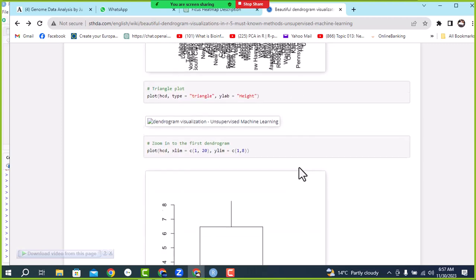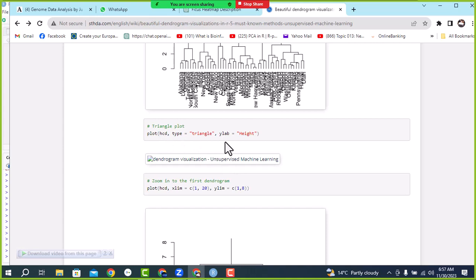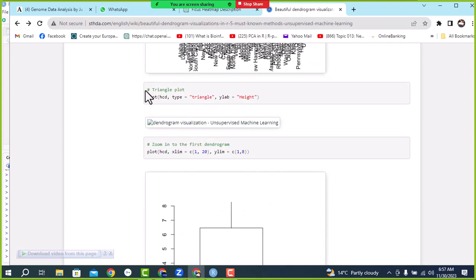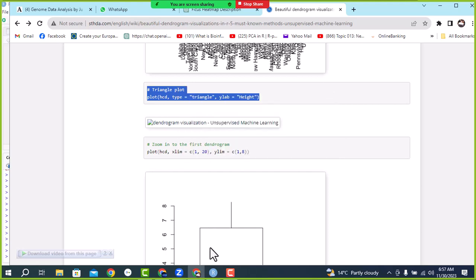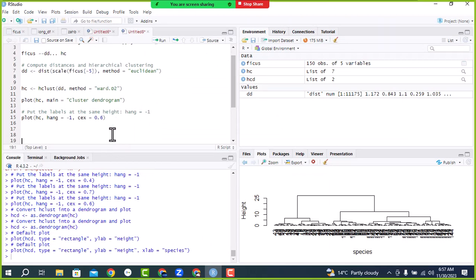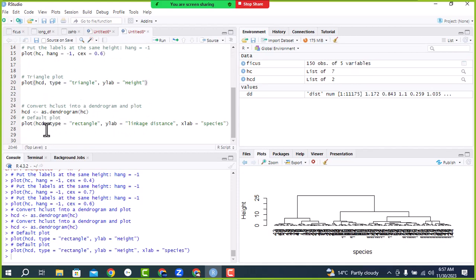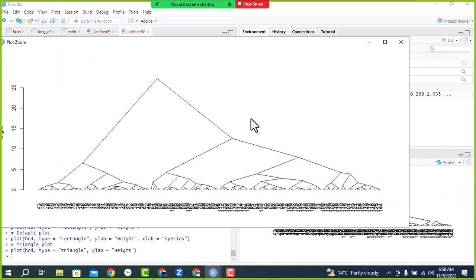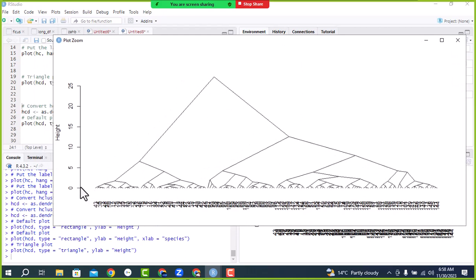Now we want to change the dendrogram type to triangle. Copy the plot triangle script from the website, paste it here. It's a similar script with just a few words edited — 'rectangle' is changed to 'triangle.' Run the script — now your plot is converted into triangle form, and you can see the scale changes as well.